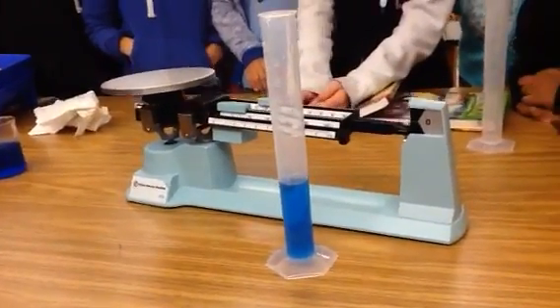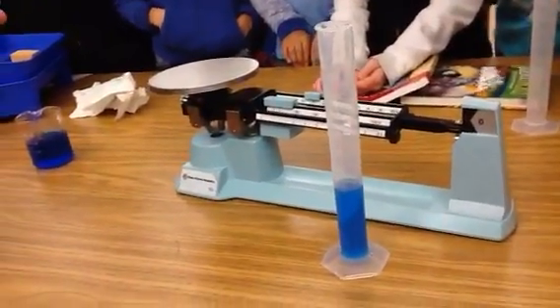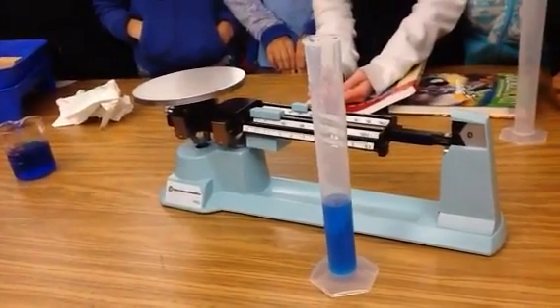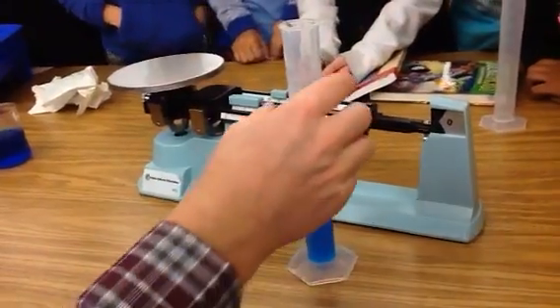Now who can tell me what the mass was of just the cylinder? Anybody remember? 37 point what? It was seven. Remember, 37.7.